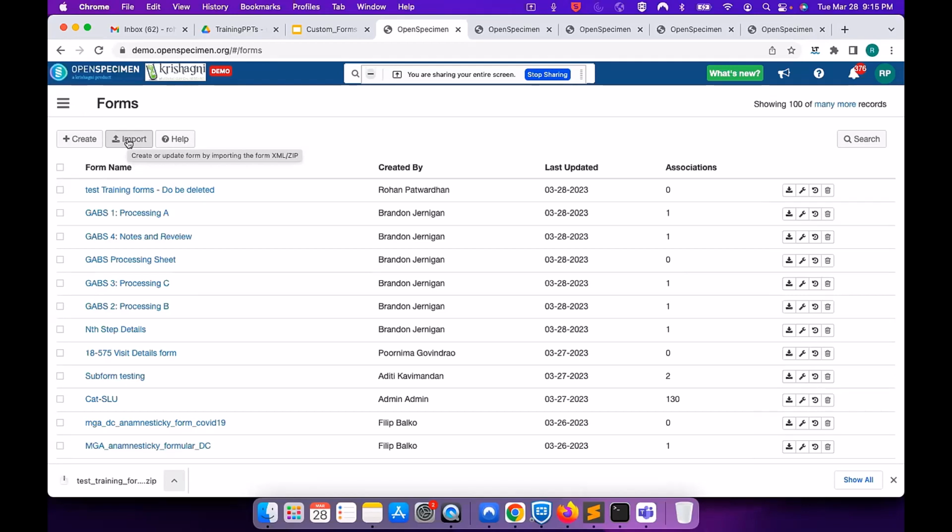Because I can share the link that I was referring to. This one here. Processing, which one? Oh, it's in the chat. Oh, okay.